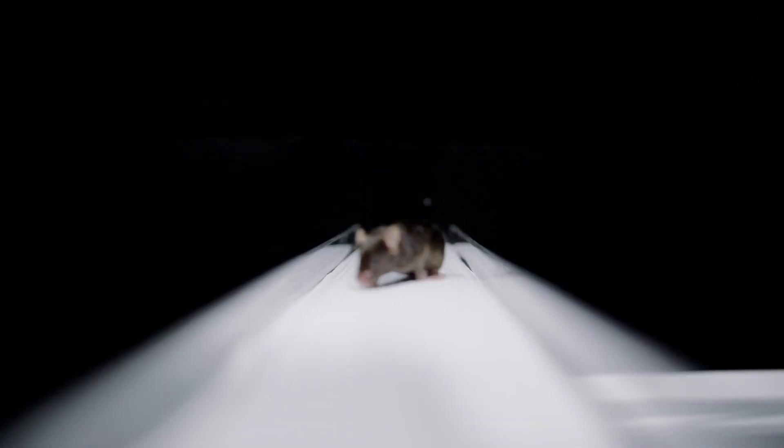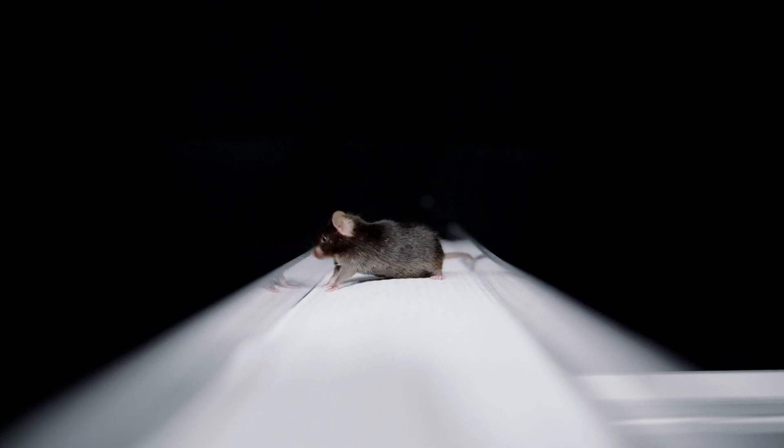Mice only move their eyes when they're moving their head. This means studying vision needs to be done on a freely moving animal.